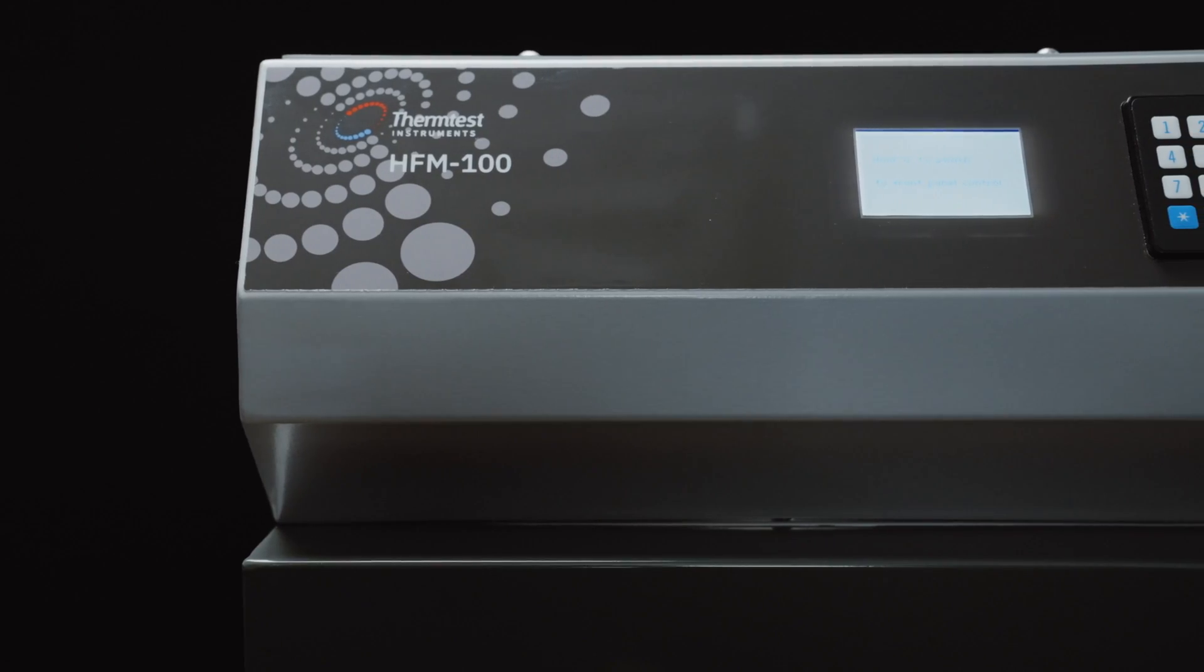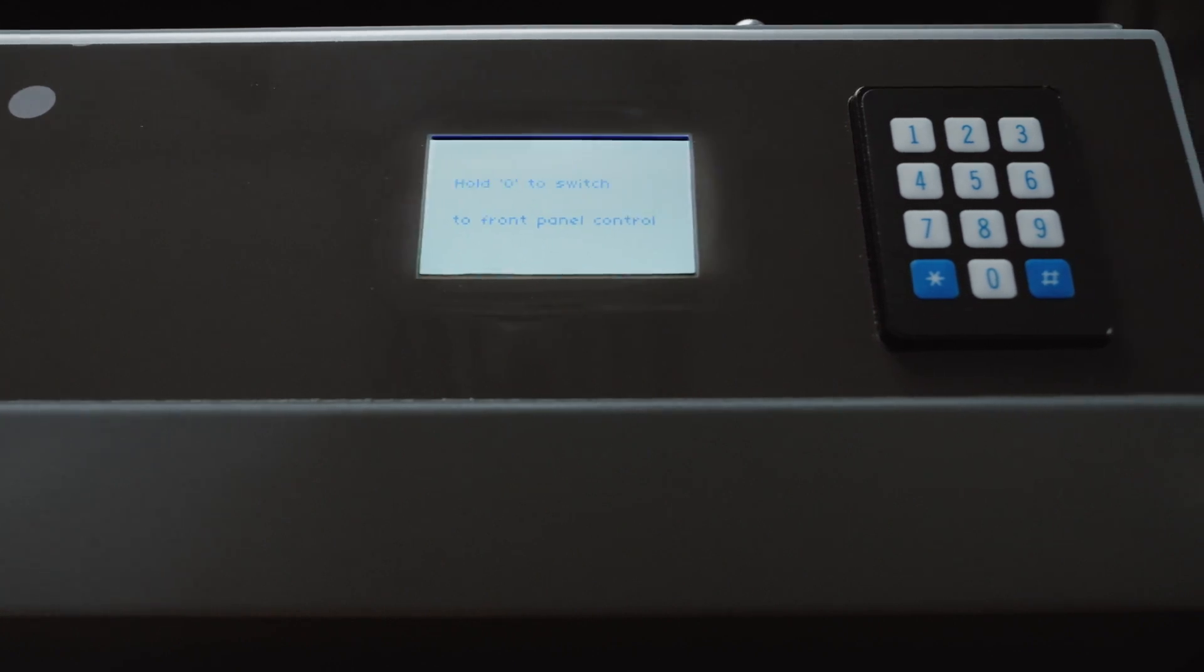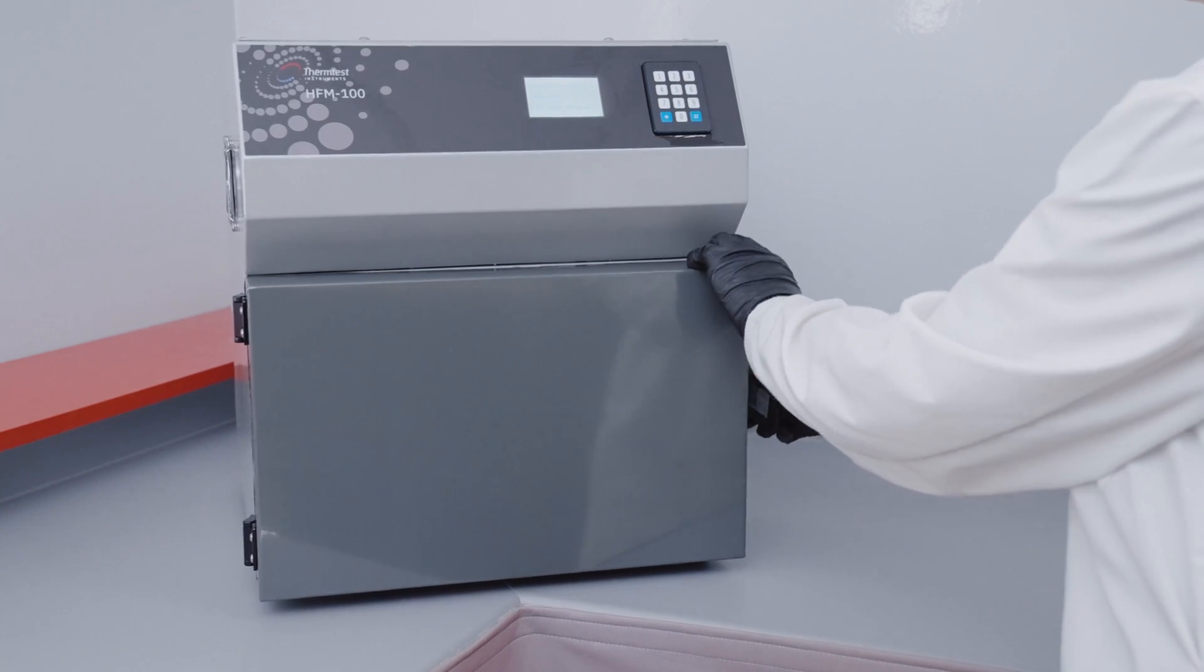Introducing the second generation HFM 100 for measuring the thermal conductivity and thermal resistance of insulation and construction materials in accordance with ASTM and ISO standards.